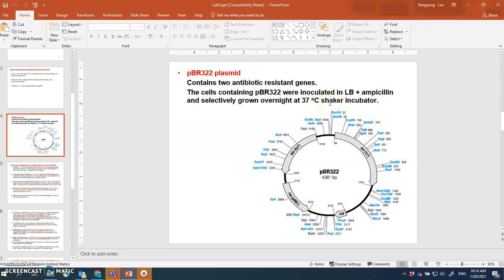If cells are settling down at the bottom of the tube, there may be cells that are crushed at the bottom. Layers and layers of cells will be found. So the cells at the bottom will be depleted of oxygen and nutrients, so they'll die from it. That's not good. So that's why you want to suspend and shake your growth container. Maybe it could be a test tube, a flask, or a bioreactor, whatever you use. Shaking, suspending the cells is very important.